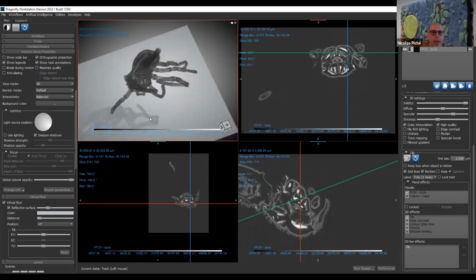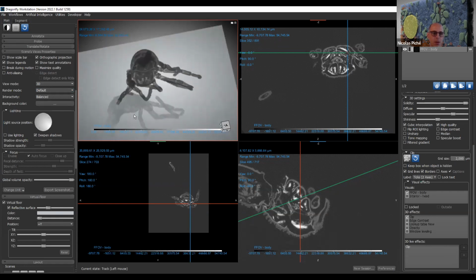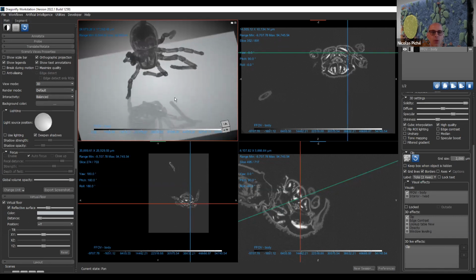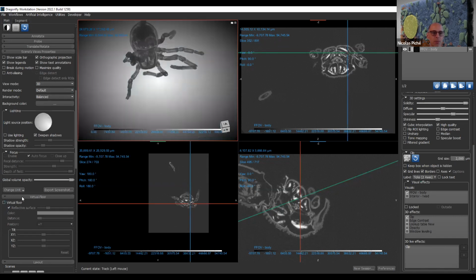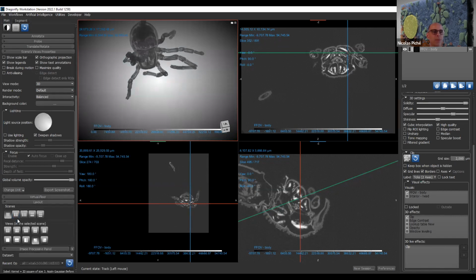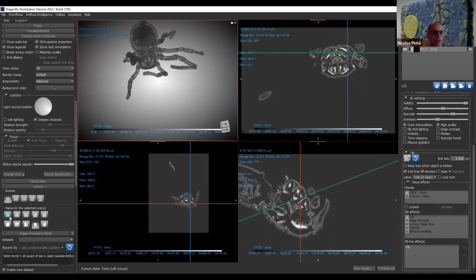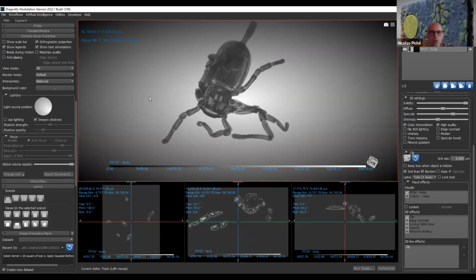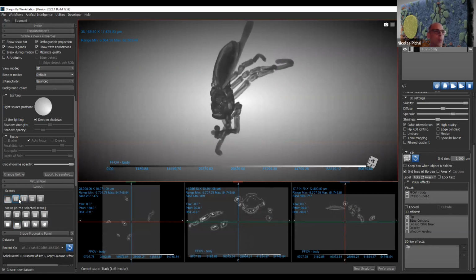I will go quite fast on certain stuff because I want to cover segmentation. So I will just show that we can do a virtual floor, but something more important, you can have multiple scenes. In the layout panel, you control the views, what kind of views you show: 2D, side by side, 3 by side, horizontal, vertical, with 3D or no 3D. This one is very popular among certain people. But you can have multiple scenes.